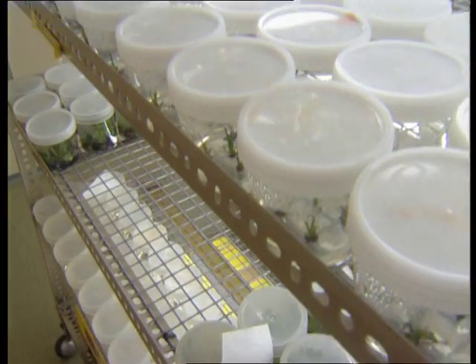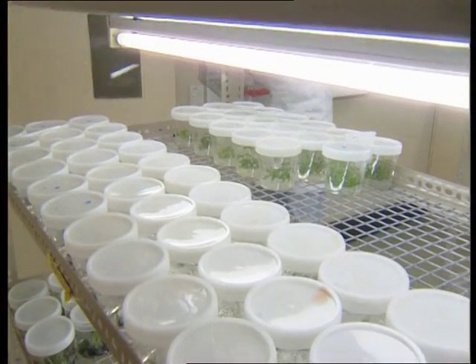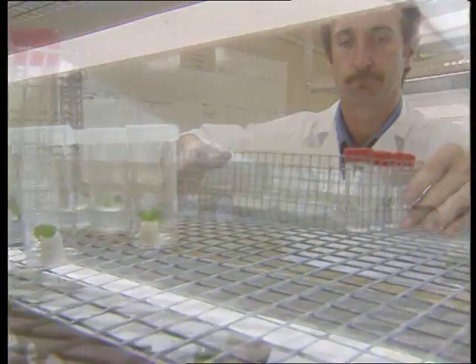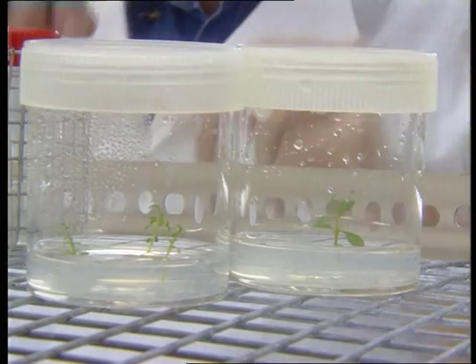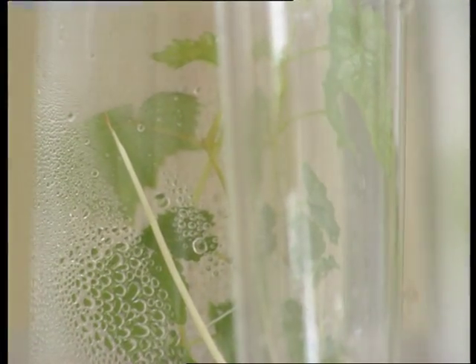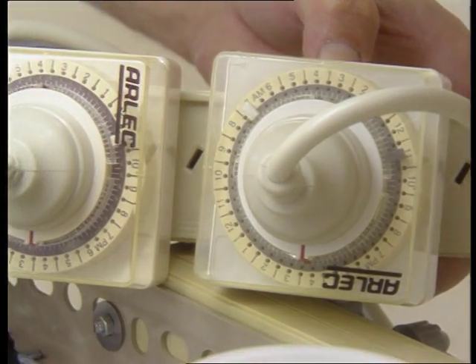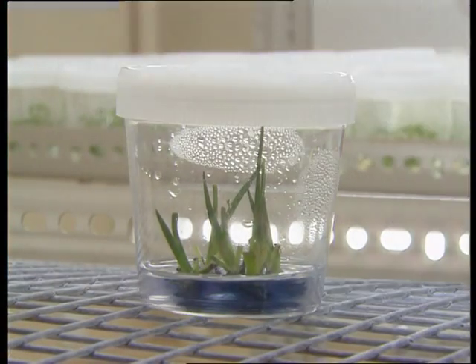These cultures are then transferred into the growth room with diffused light. The light intensity in a growth room like this is about 50 micromoles per square metre per second, which is about 1/50th of sunlight on a cloud-free day, so it is not very strong. The photoperiod, as a general rule, is set at around 16 hours day and 8 hours night, although this might be altered depending on the species and the time of year.